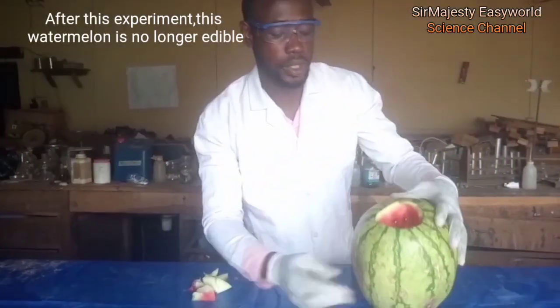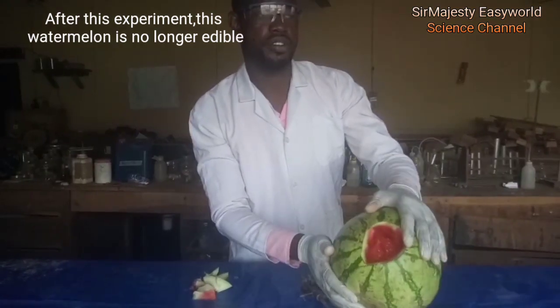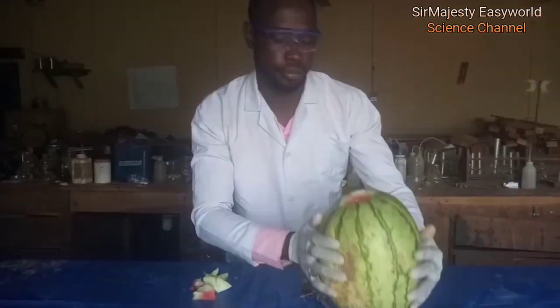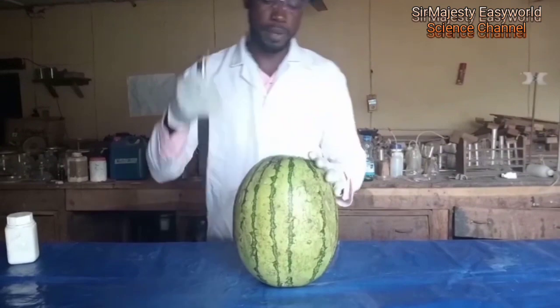Warning: after this reaction, this watermelon is no longer fit for consumption. Don't try it at home. It has rendered this no longer edible. Play with caution. Watermelon — first, let's open the watermelon.